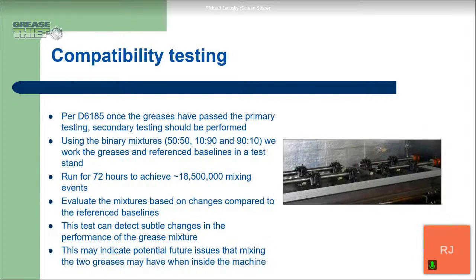So we mentioned the compatibility testing, and rheology is an extremely important part of the evaluation for the compatibility testing that we do. This is also very important right now with supply chain issues with lubricants, that we've had a lot of customers who can't get a grease and they need to find a compatible grease that they can use instead of having to worry about, if we put this in, are we going to have a problem with the asset that we're maintaining.